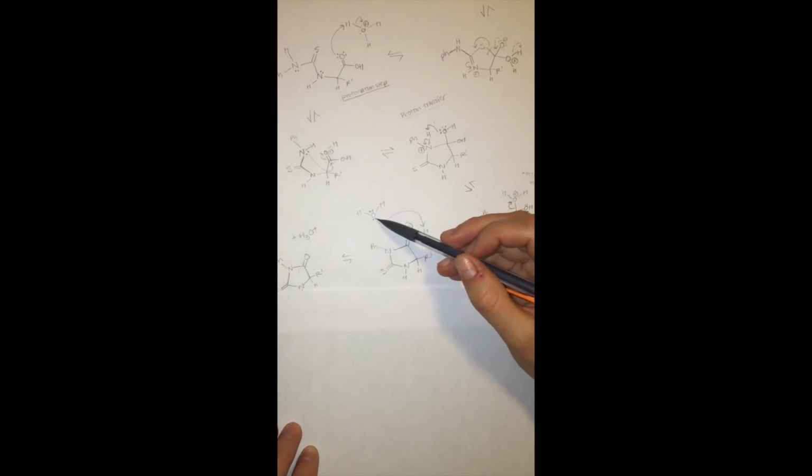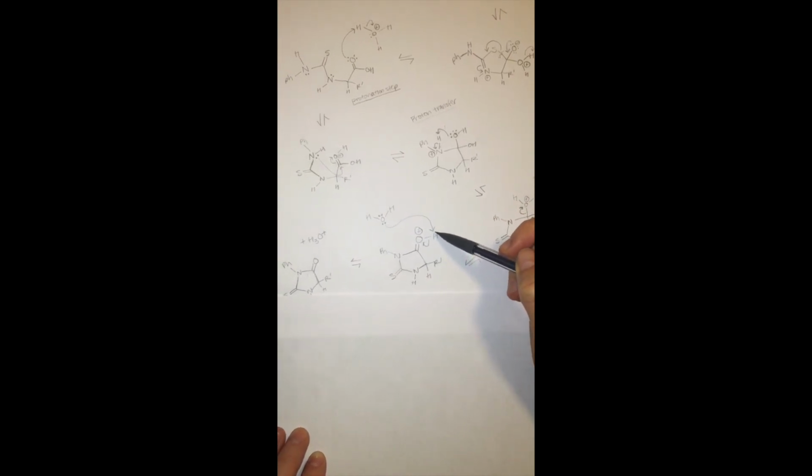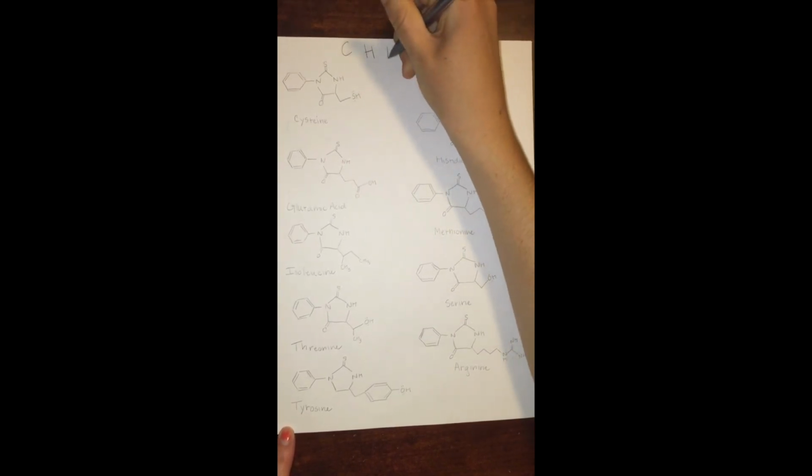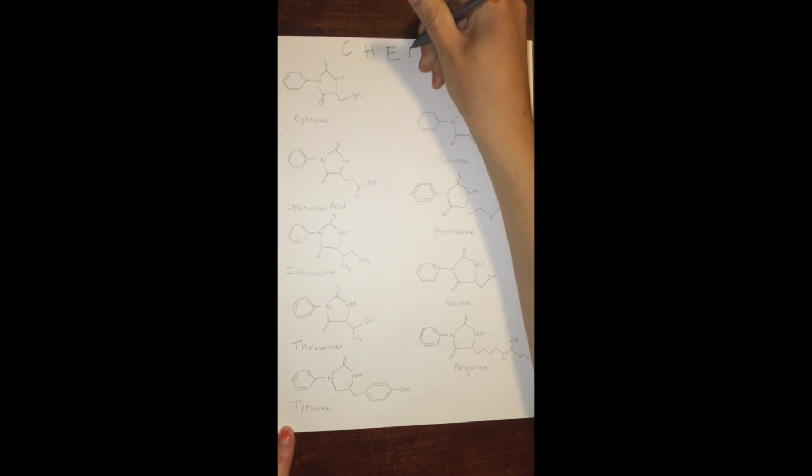A water molecule then comes in to steal the hydrogen to give electrons that positive charge, and we are left with the phenylthiohydantoin product. The Edman degradation pulls a single amino acid off the N-terminus at a time. This allows us to figure out the order. Our first one was cysteine, followed by histidine, and after we had repeated this 7 more times, we found the sequence of our protein.